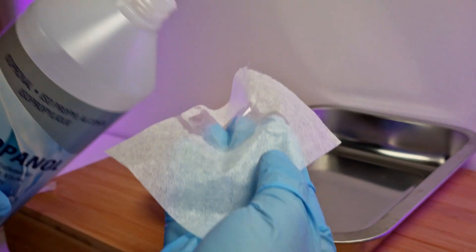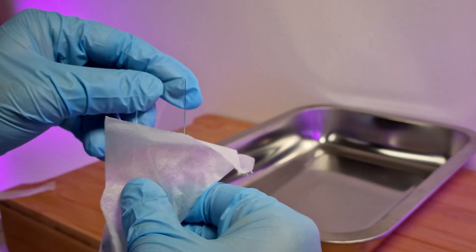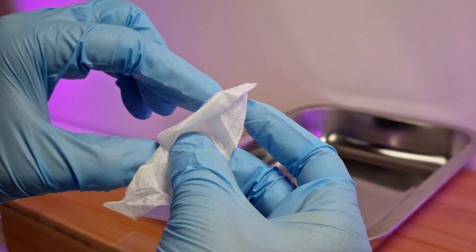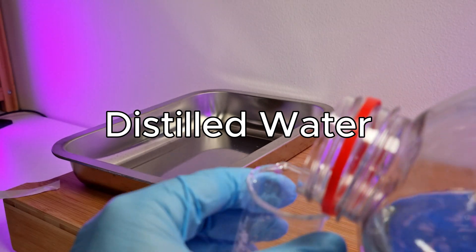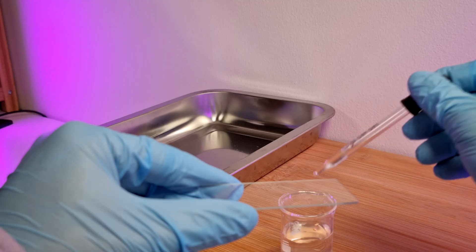In order to get as close as possible to accurate results, I cleaned the slides with special lens paper and isopropanol. First I'll check distilled water as a reference to examine any potential impurities that may come from the glass itself.